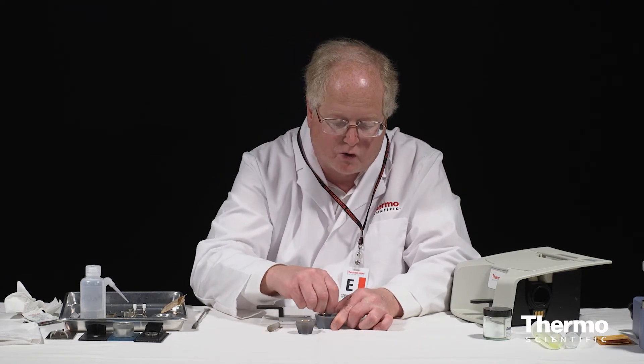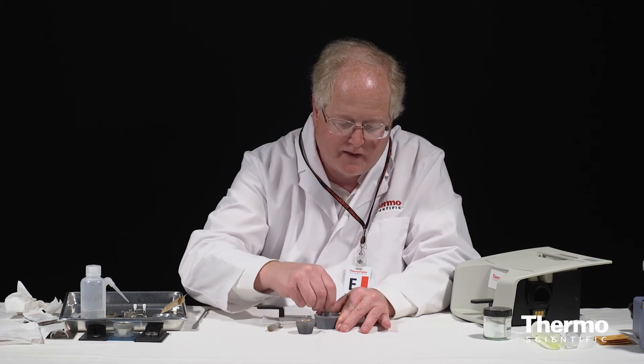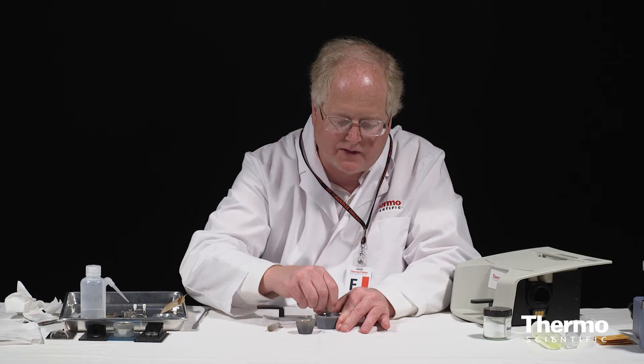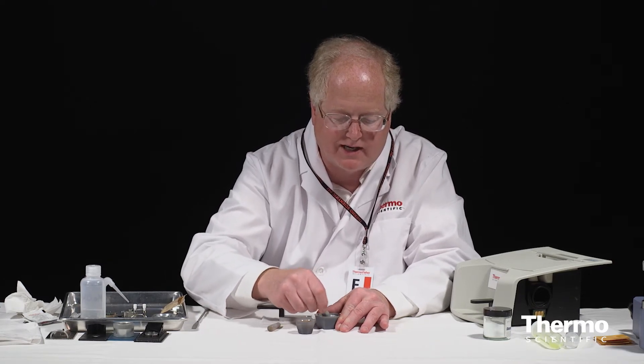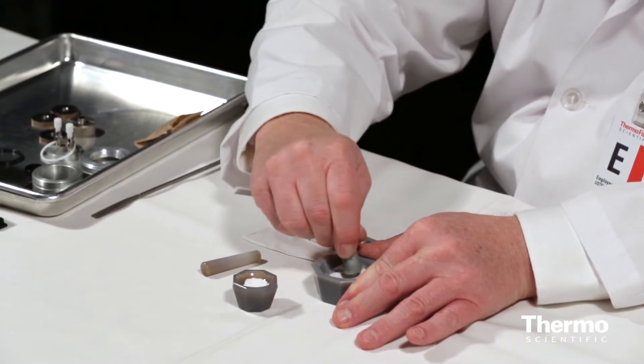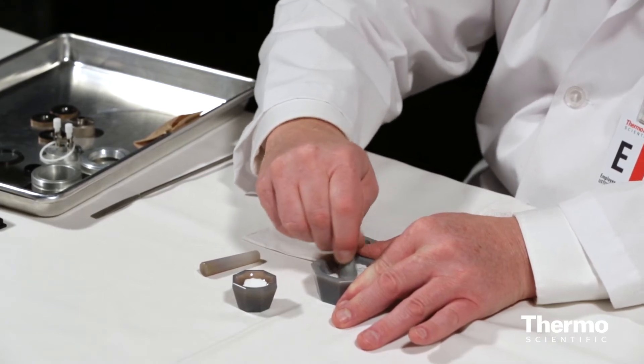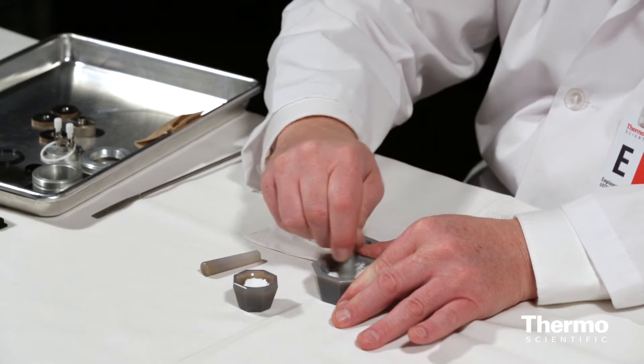Now the grinding is going to do two things. First of all, it's going to make the crystal size or the particle size consistent. It's going to give me a more diffuse reflecting surface. And secondly, it also serves to homogenize the sample, to mix the sample and the potassium bromide together in there into the powder.